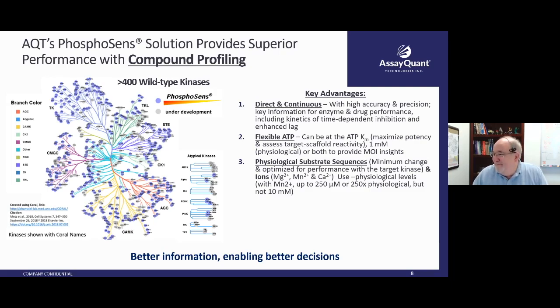All right, and then it looks like we have one more question that's come in. Do you ever develop larger protein substrates with the SOX technology? Oh, that's a question we get an awful lot. It's something we have explored, and I know that some other academics out there have actually explored this as well. It's not something we routinely do.